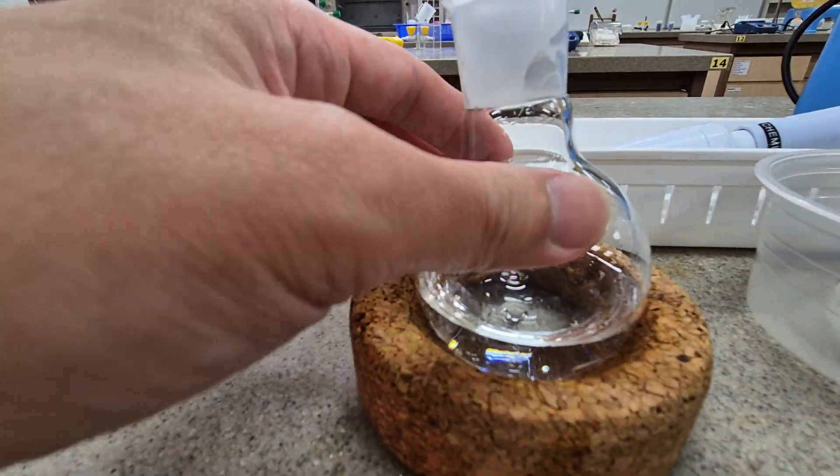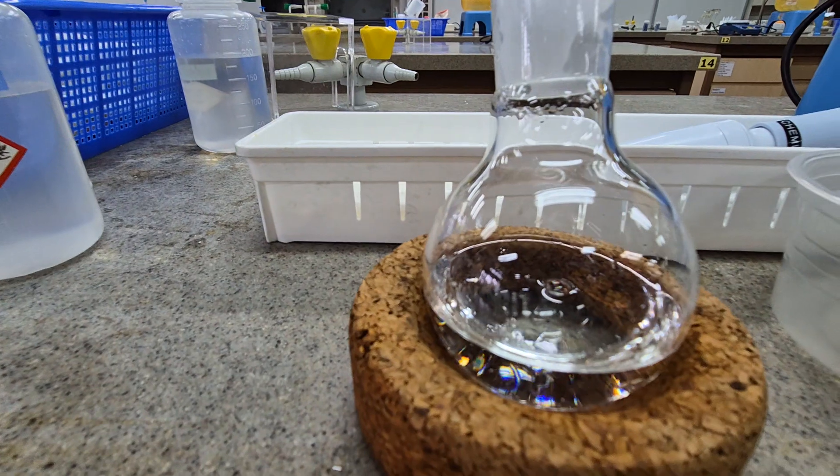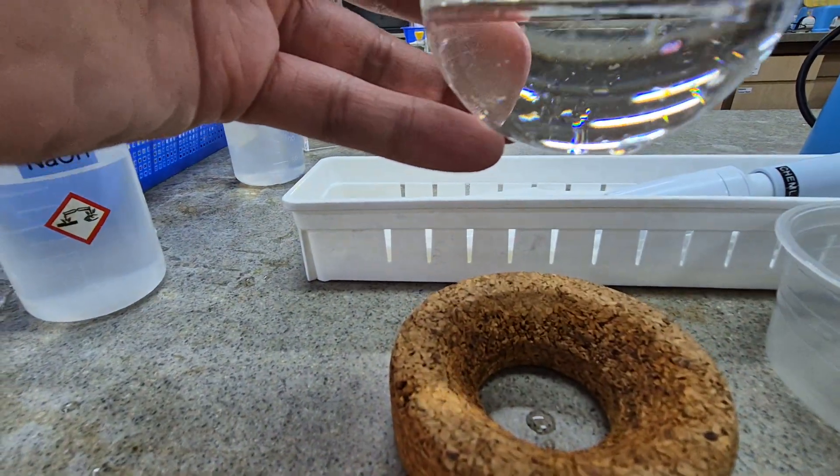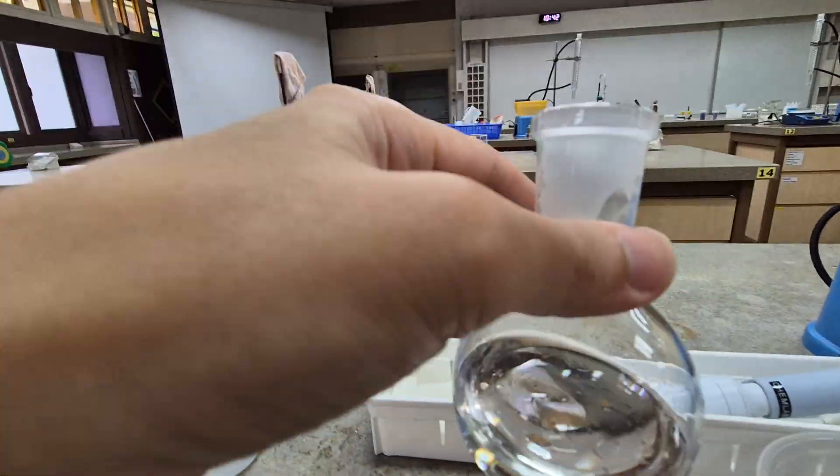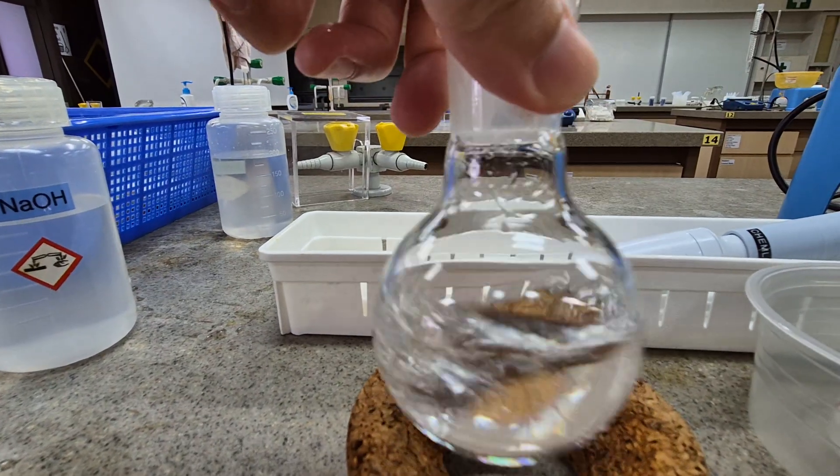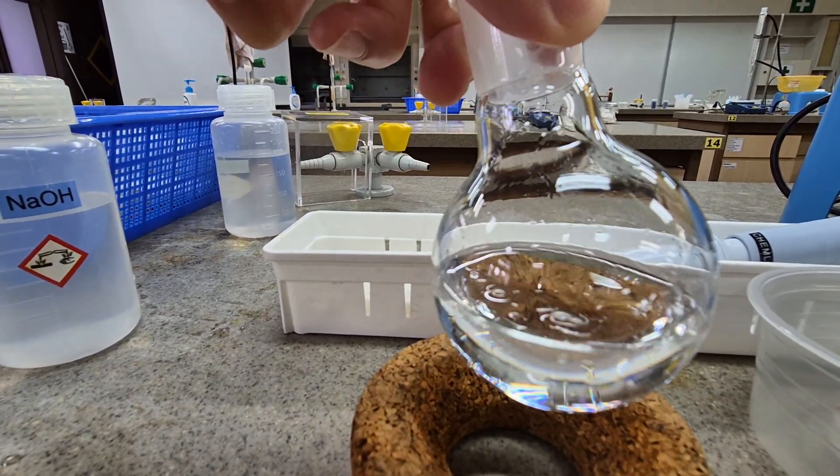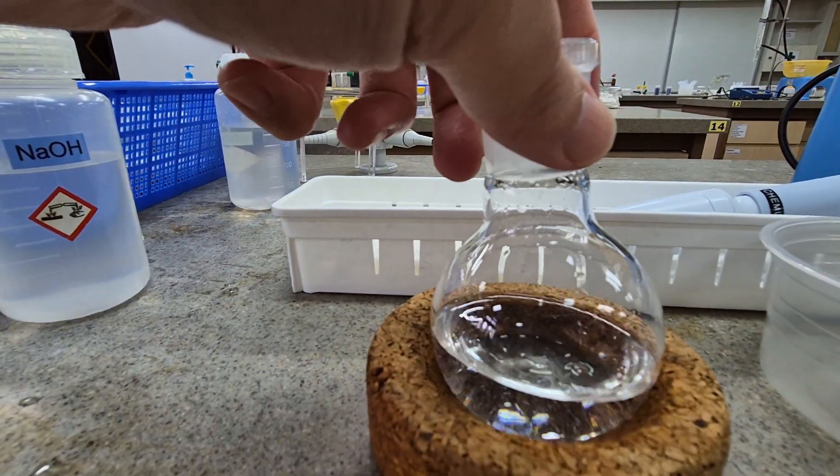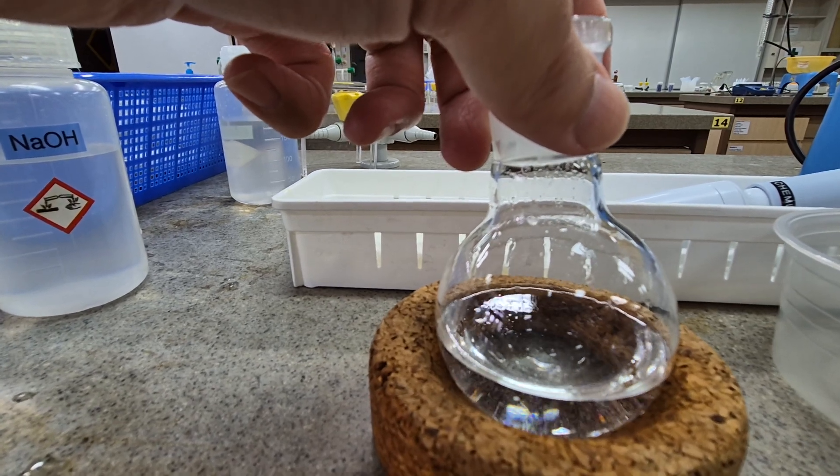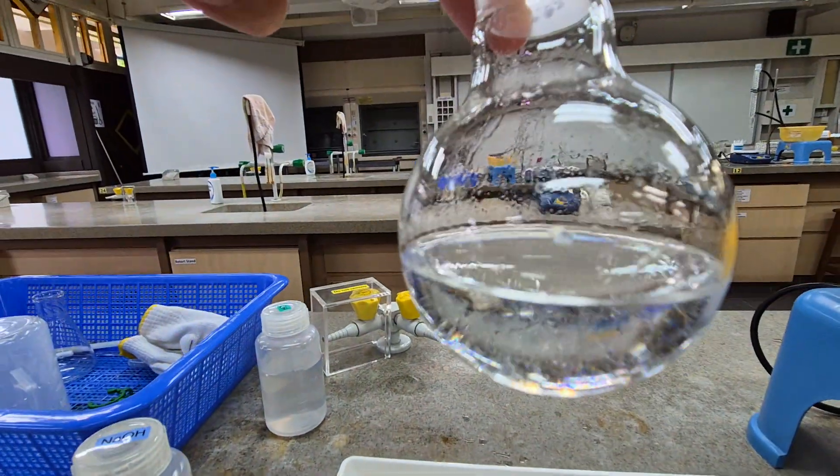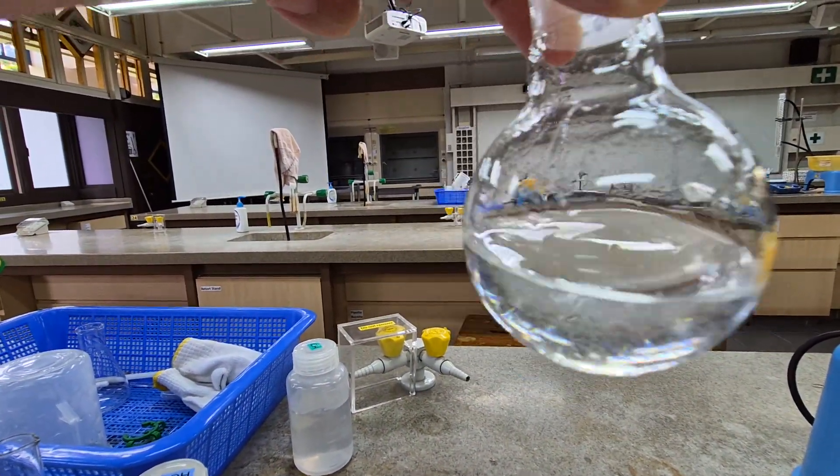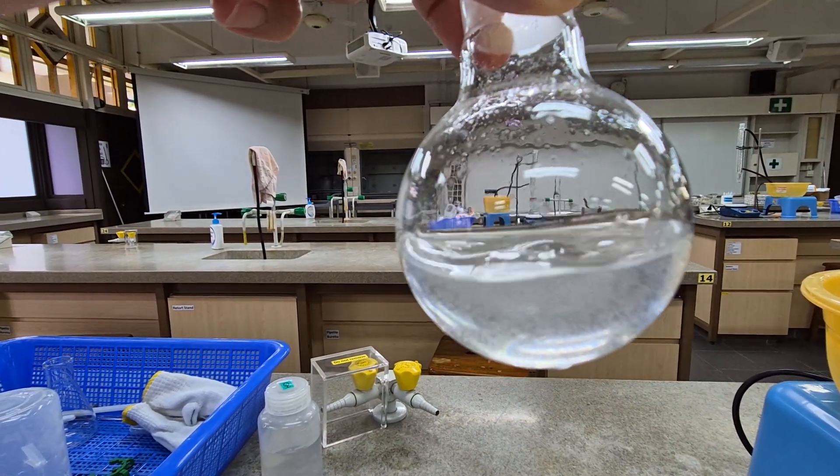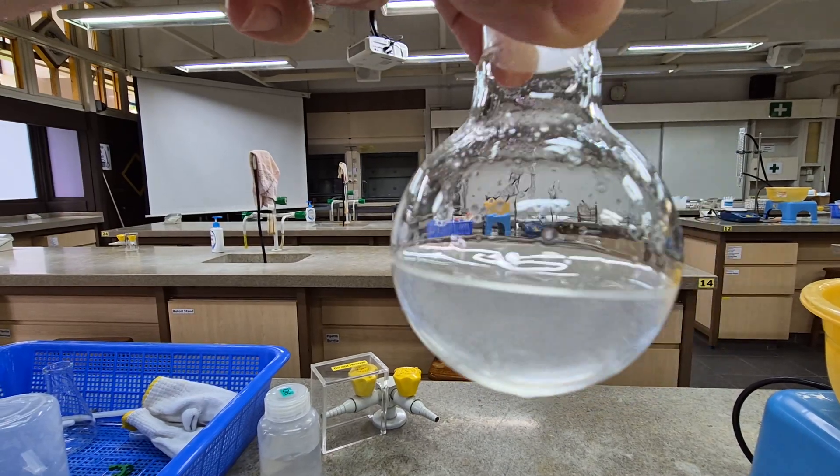You observe that the white precipitate slowly appears, bit by bit. It's getting more and more cloudy. It might be a good time for you to ask yourself why is this the case, why does white precipitate start to appear. I think it's quite obvious.